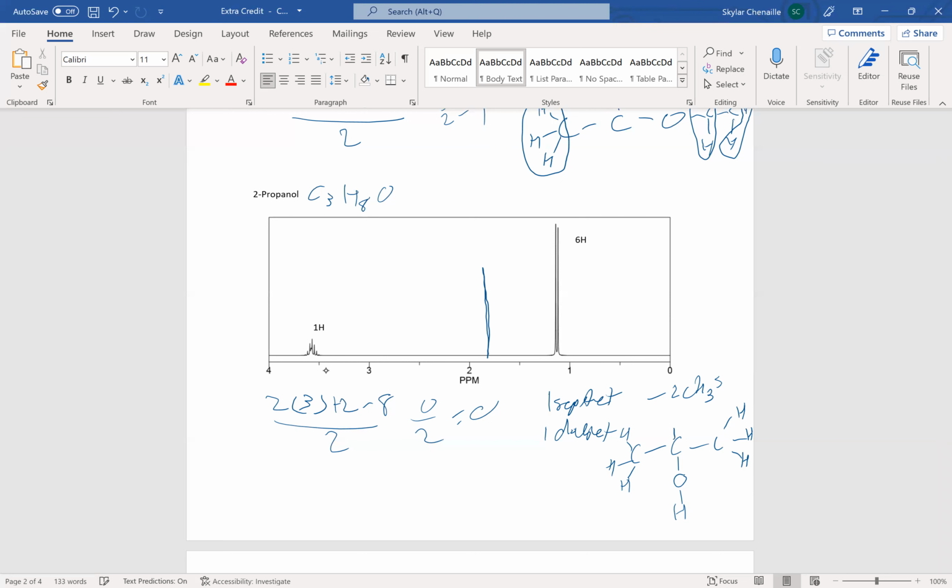We have that, we can throw one there. That way this carbon has 4 bonds. Perfect. So let's look at the grouping here. Remember when we said that we should get a third reading actually. Now the reason we get a third, these two are equivalent, right? Because it's a symmetric molecule. So these ones are equivalent. That's 1. But this hydrogen and this hydrogen are not because of this oxygen right here. That oxygen should produce one here. So this might be a bad graph.